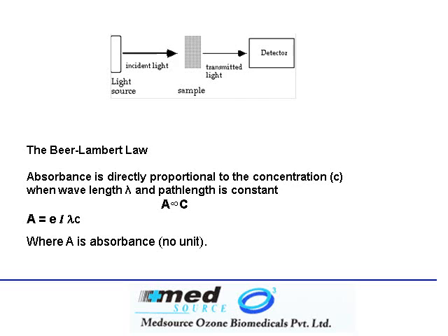Now, the most important measurement that we make for a biochemistry assay is the absorbance. Look at this diagram. On your left, you see a light source, which is typically a lamp or a halogen lamp. In the middle is where you will have your flow cell or cuvette, which will contain the liquid that is to be measured for absorbance. And on the right is your detector.